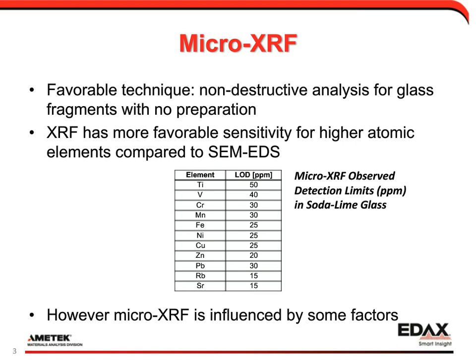So while we are mostly familiar with the benefits of Micro-XRF, and these are advantages that are relatively universal for the technique, as mentioned, there are still some hurdles and some issues when interpreting the spectral data when it comes from such a variety of sample shapes and sizes. These are issues that would typically not be present if the samples were all uniform in thickness and shape, or if they were all bulk thickness.